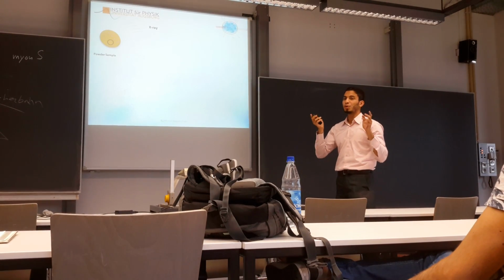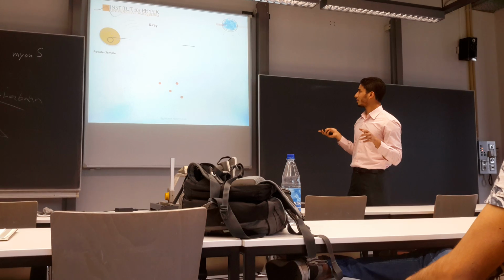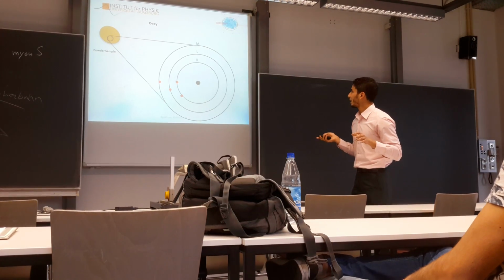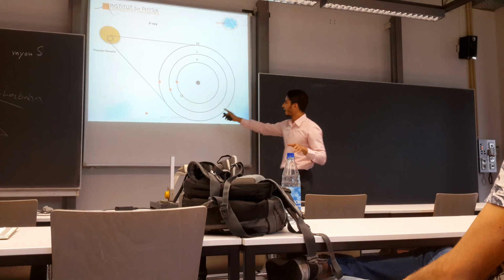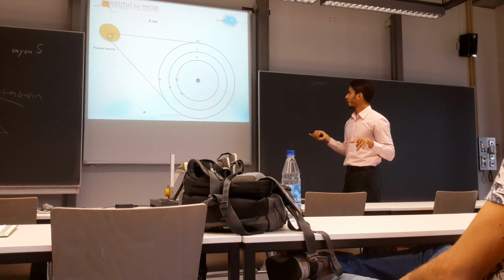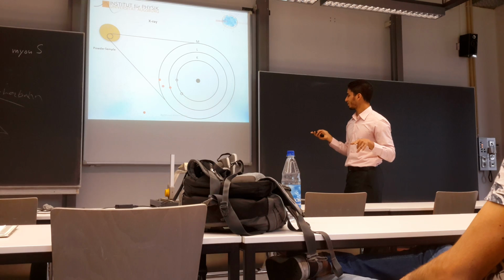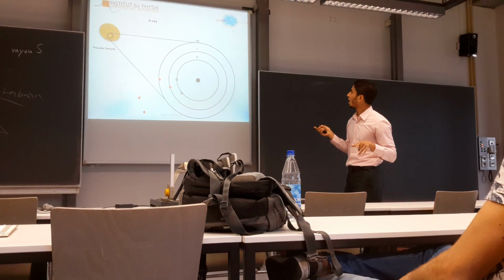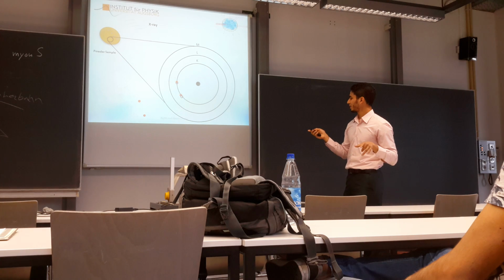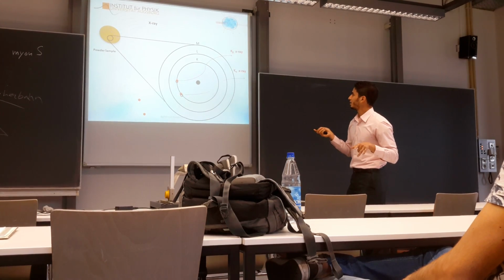Now you can get more details. As soon as we apply X-ray to a powder sample, X-ray ionizes electrons and they are ejected out of the atoms. At the same time, or after this process, electrons from higher energy levels drop down into this vacancy.